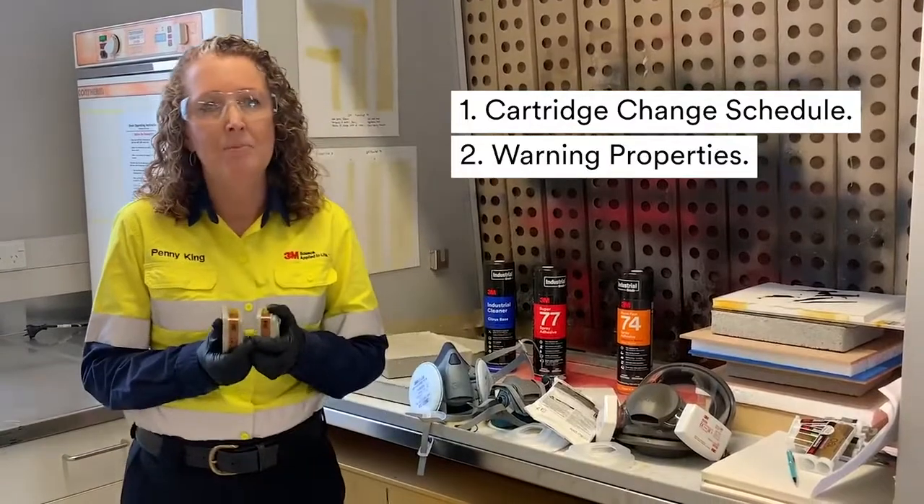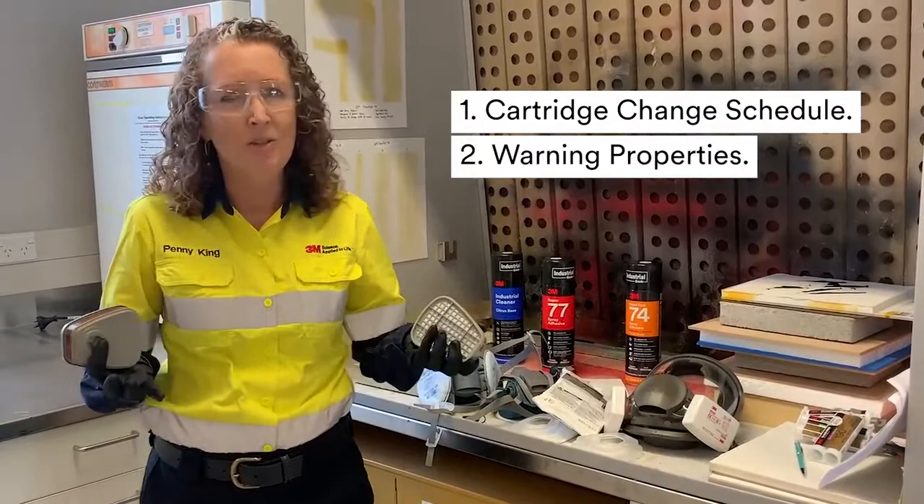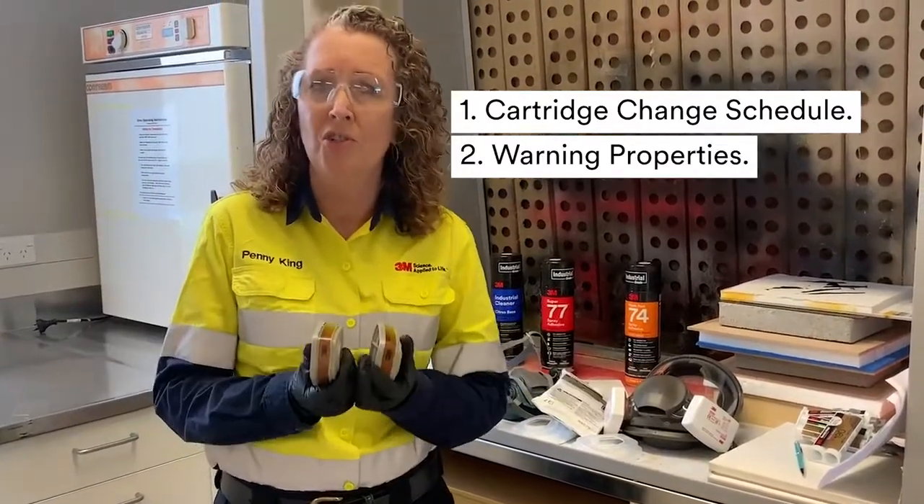Step 2: In the past we may have used smell, taste, or irritation as indicators to change your cartridge. Now, as humans we're not foolproof, so this should not be relied upon.